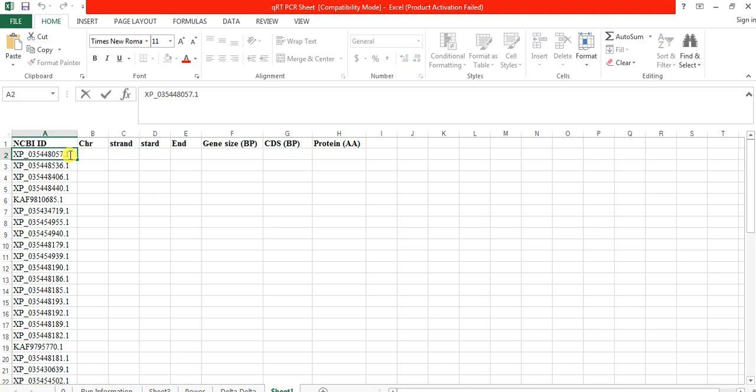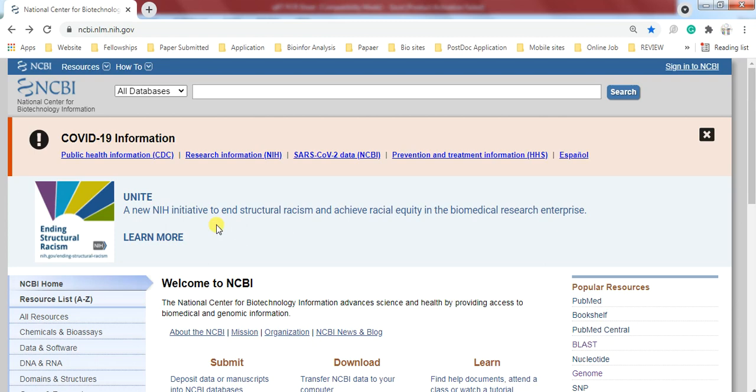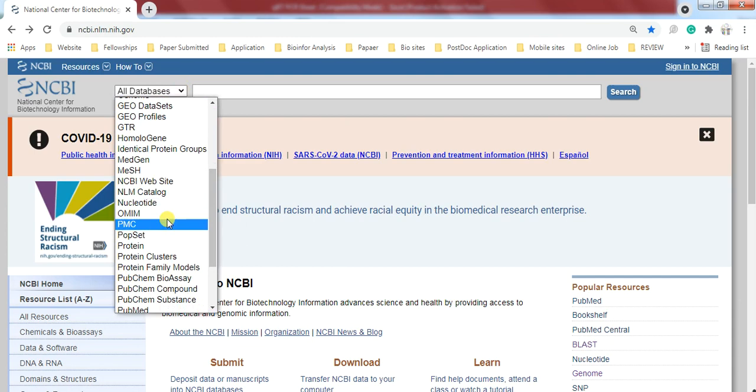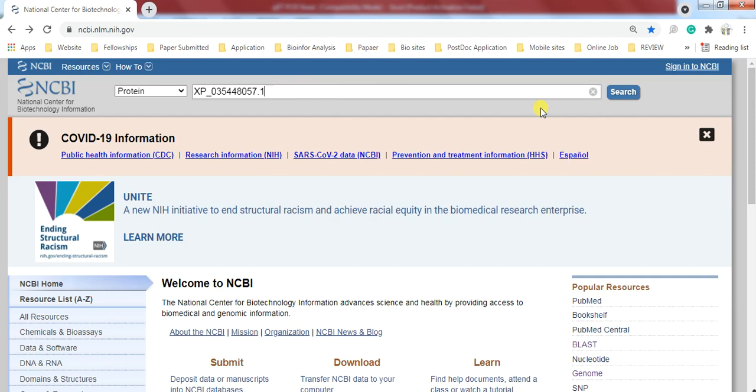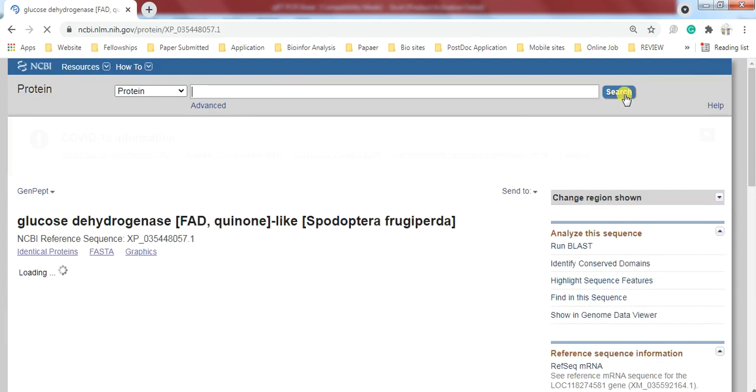First, you need to copy this ID and open the NCBI website. Go here, select protein, and in the search box paste that script and click on search.